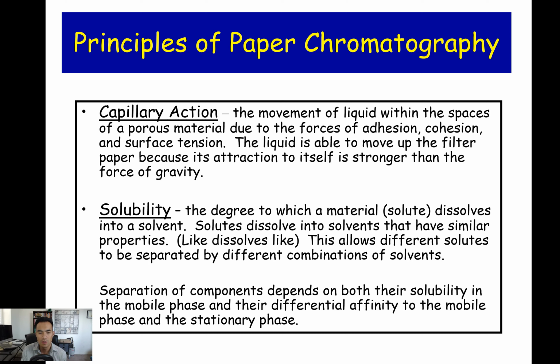And various different solvents have different degrees of solubility, as you guys tested today. Specifically things like the alcohol versus sodium chloride, and what concentration had higher solubility versus others that had low solubility. So when we're thinking about solubility, you always want to think about this idea called like dissolves like. In other words, we're looking at polarity versus nonpolar molecules, and also how do things change when you're increasing, for example, salt concentration versus increasing alcohol concentration.